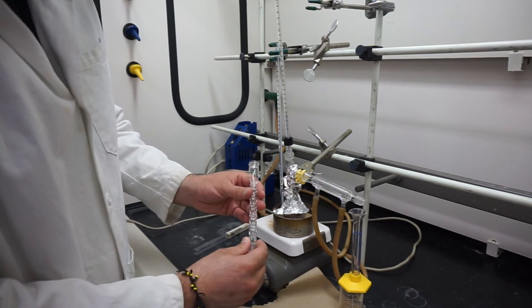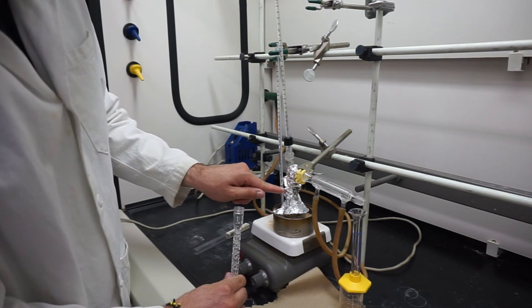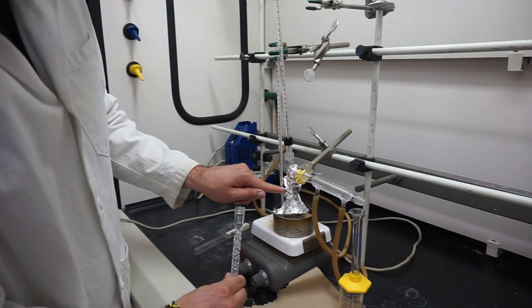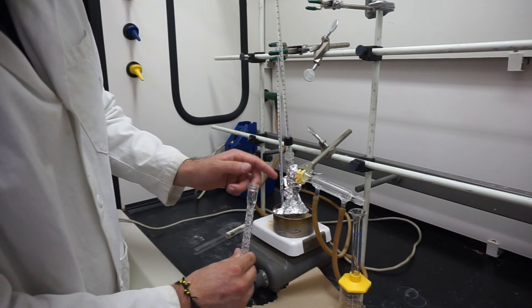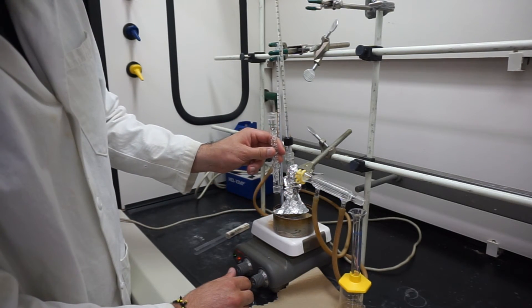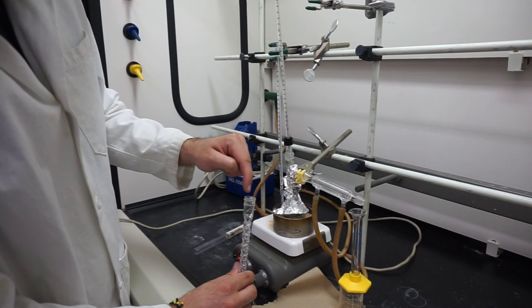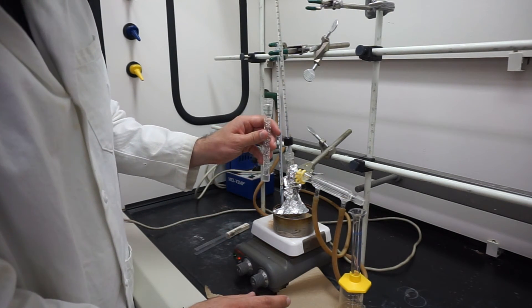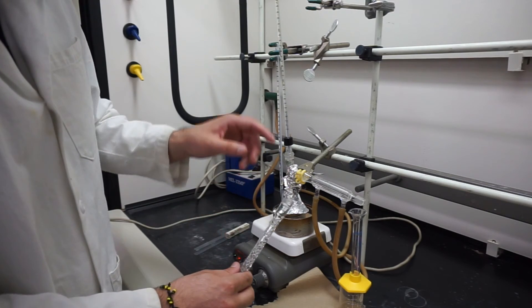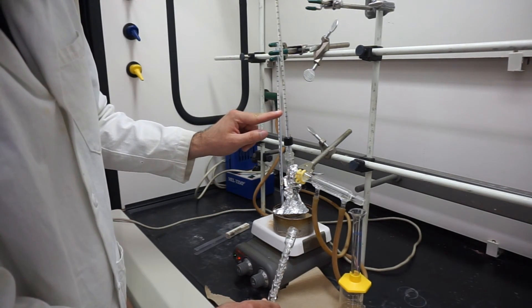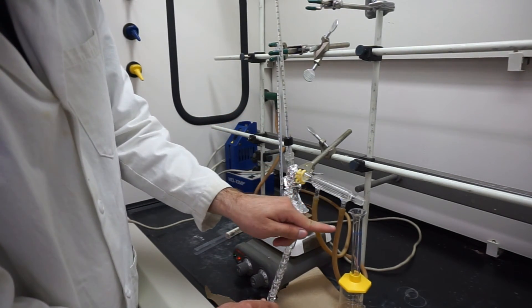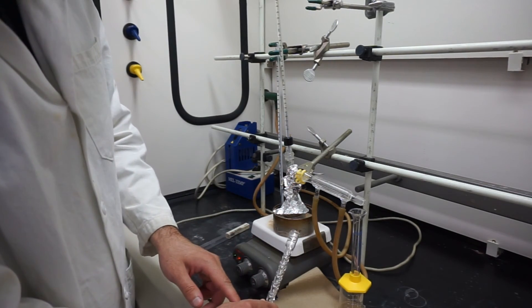Now the distillation with the Vigreux column, the only difference is we're going to take this part out and we'll attach the Vigreux column right here, and then the distillation head will go on top. That's the only difference between the two setups. You're still going to be monitoring the heat as it distills over and collecting in your graduated cylinder.